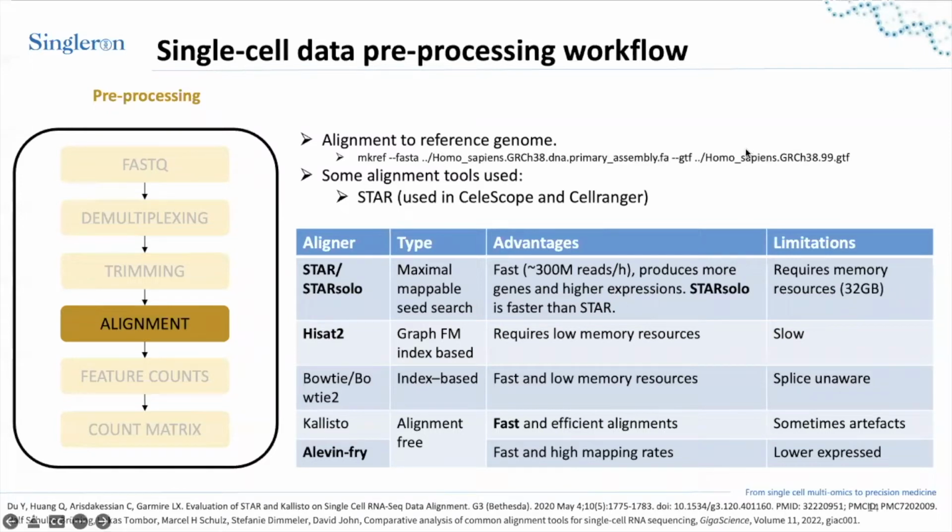So if we want to do any inclusion or exclusion of certain genes, we can do it at the level of the GTF. For example, if we don't want the pseudogenes to be aligned as part of the reference genome, these pseudogenes can be removed by processing the GTF file. So eventually only the genes that exist in the GTF file and map to the primary FASTA sources will be looked at and counted later.